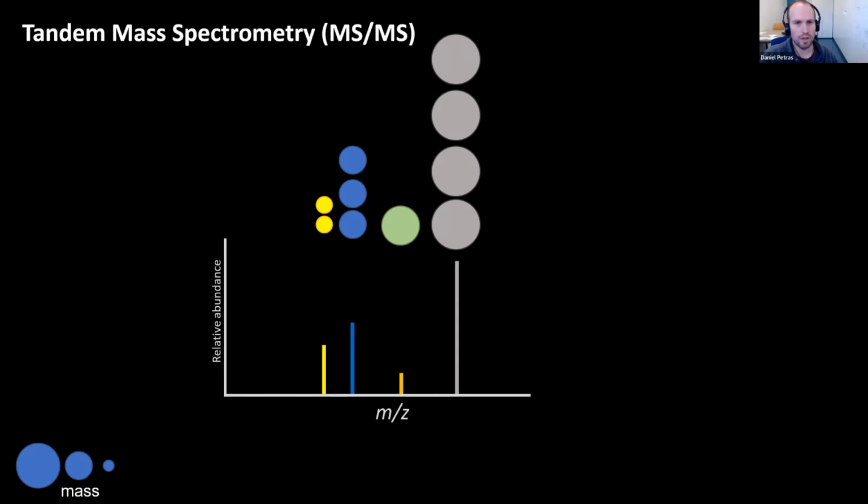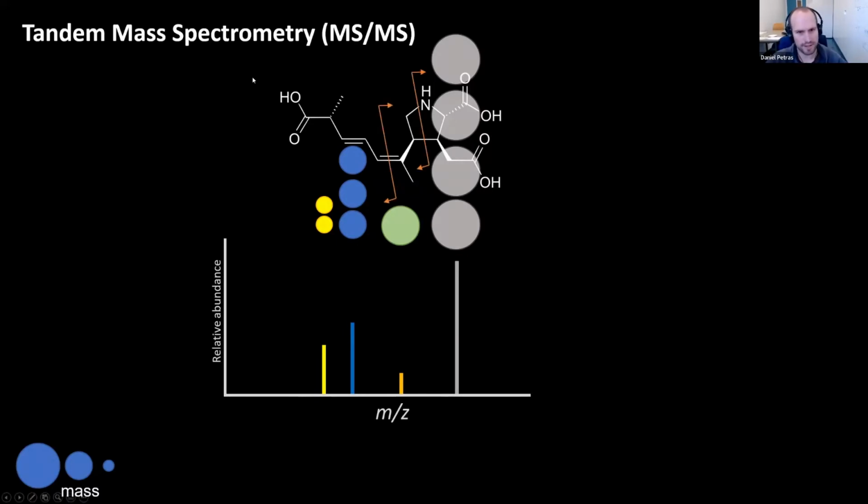And that is very cool because, depending on the technique I use, those fragments happen depending on the structure of the molecule. So here I just made this example up, but if we would take domoic acid and we had a technique that here breaks nicely the CC bonds, then eventually we could explain the structure of this molecule by the fragments we observe.